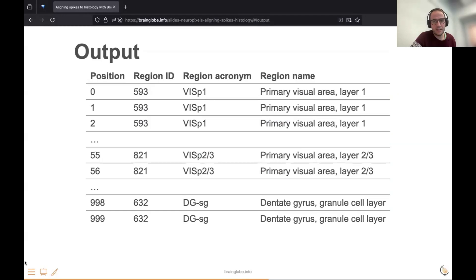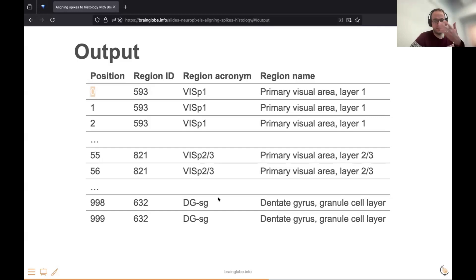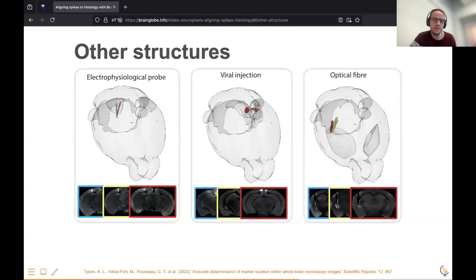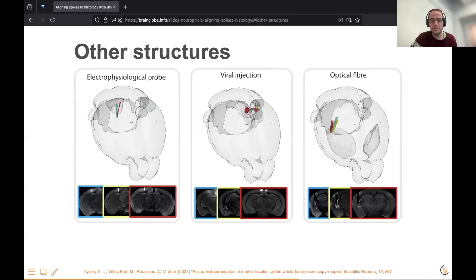The output you get is the position of each point along the Neuropixels probe and which brain area it was inside — essentially an Excel sheet telling you which brain regions the Neuropixels probe went through. This can also be used for other things: if you have viral injection sites or optical fibers in your brain, you can use the same technique to understand where things are in the brain relative to an atlas.